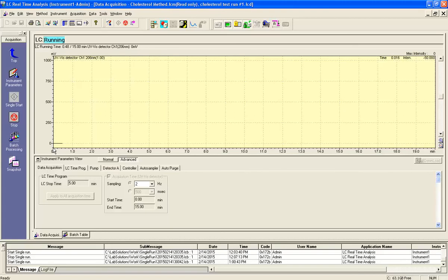So what should I see? Well, right now cholesterol is coming through the machine and it's going through the column, and sooner or later the cholesterol will leave out of the column, and when it does, my detector is going to show me your cholesterol has left the building. Okay, so what I will see here on the computer screen is something that shows that, right? And here it comes. So up, up, up, up it goes. And then it's coming back down, slowly but surely it's coming back down. And hopefully what will happen is that it will go back down to what we call the baseline.